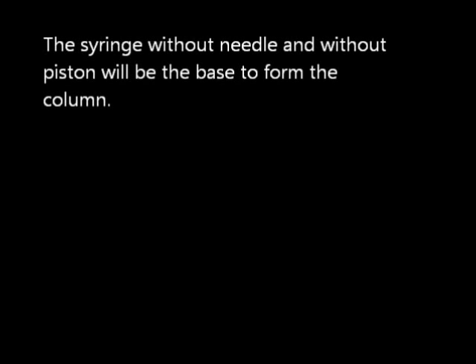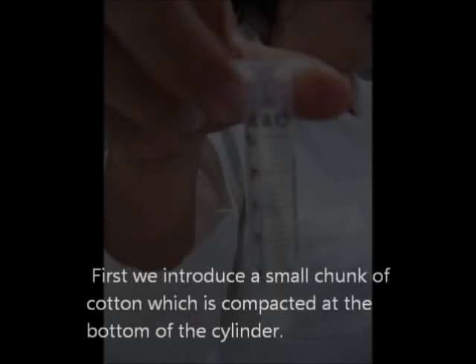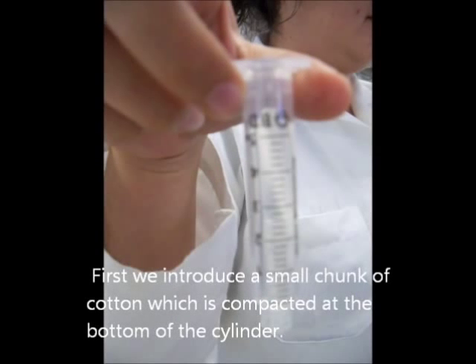The syringe without needle and without piston will be used to prepare the column. First we introduce a small chunk of cotton which is compacted at the bottom of the cylinder.